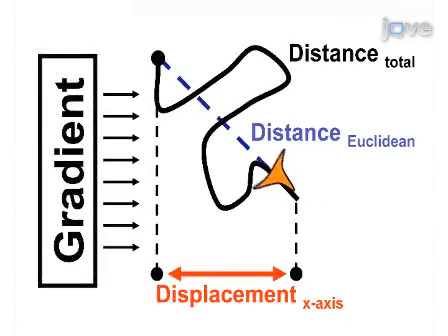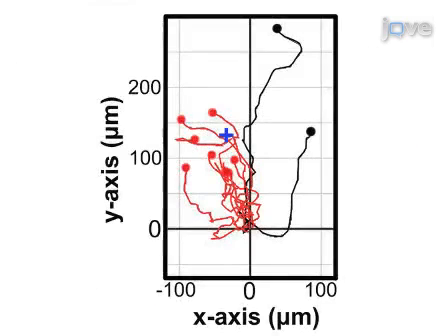The final step is to track and analyze the migration of the peripheral neural crest cells positioned along the selected border of the culture using ImageJ software. Ultimately, it can be determined whether the selected molecule can alter cell directionality or other migratory characteristics, such as speed, through the analysis of the cell trajectory data obtained.